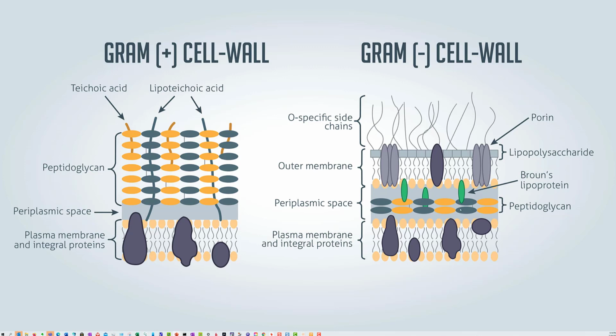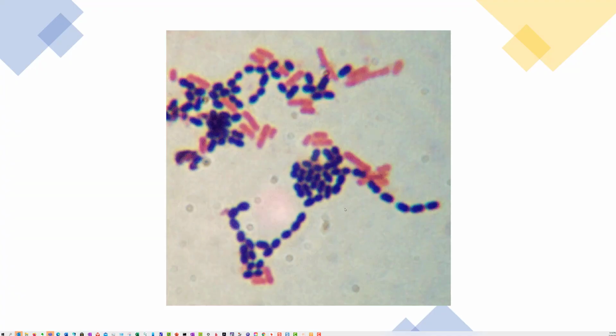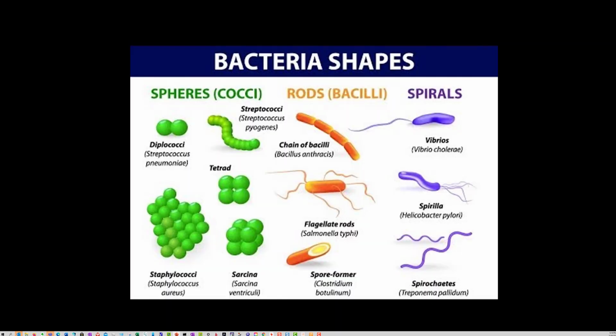The peptidoglycan in the gram negative is sandwiched by two membranes, the outer membrane and the inner membrane, so it's a totally different cat. The iodine mordant traps the crystal violet dye into the matrix of the peptidoglycan, where that's not possible in the gram negative, and it's really the difference between these two. Very stunning. Gram was amazing to figure that out. He didn't understand what was going on, he just knew that it did work.